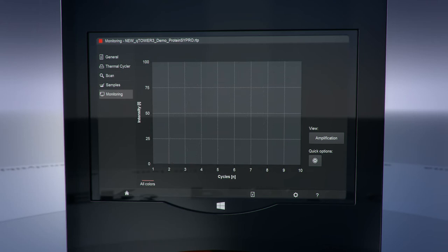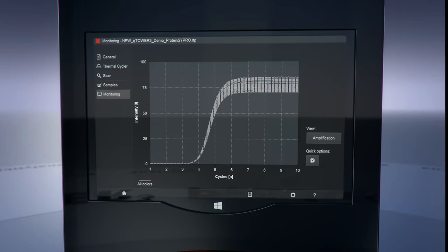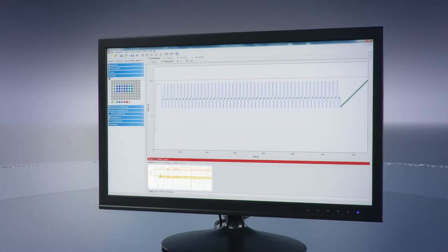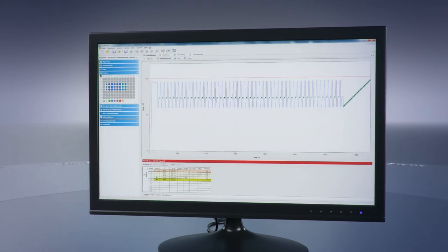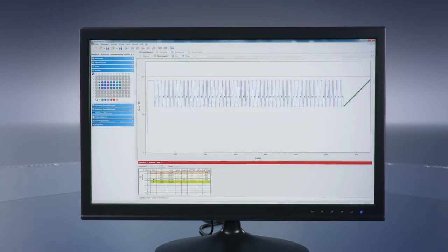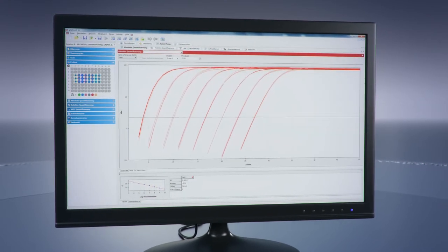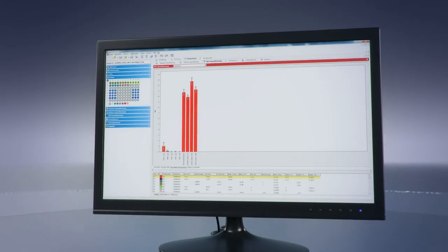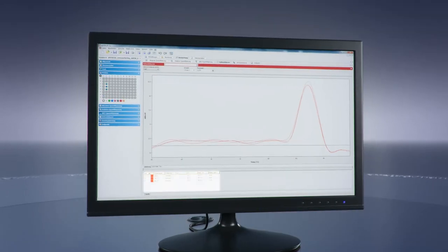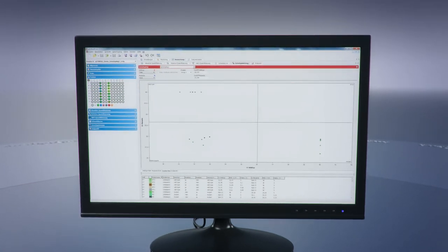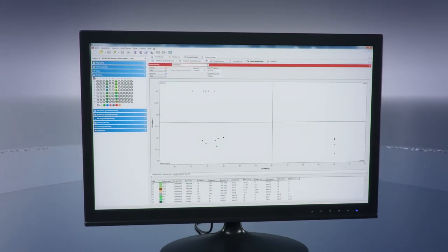Experimental results and data are compatible across all Q Tower platforms, including Q Tower 3 Touch with integrated 10-inch touchscreen control and Q Tower 3 with PC-based Q PCR Soft software. Q PCR Soft is both simple to use and clearly laid out, integrating a full range of evaluation algorithms including absolute and relative quantification, delta-delta CT method, PCR efficiency and melting point determination, allelic discrimination, genotyping, and multi-plate analysis.